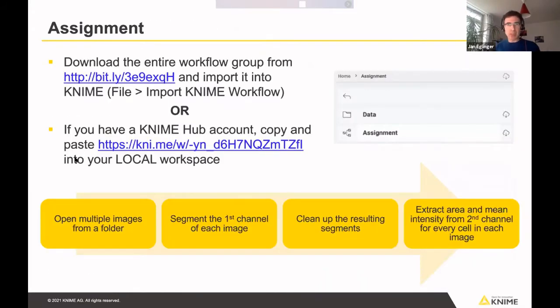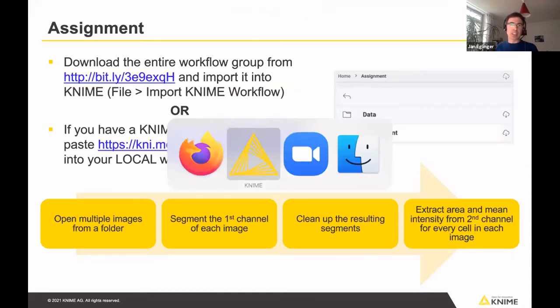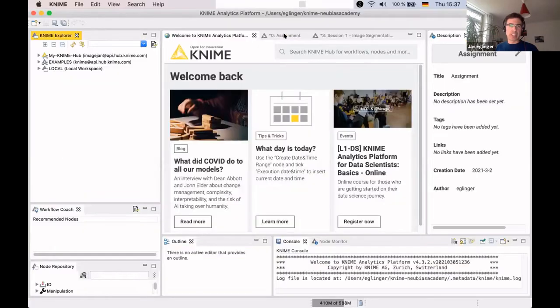Now I'll jump to the assignment we gave at the end of the last session. Here are the links again — the assignment workflow is available online; you can download it as an archive or go to the Hub and download it from there. Given the webinar format we can't make it fully interactive, but I will walk through a proposed solution interactively in KNIME. Let's switch to the assignment workflow.